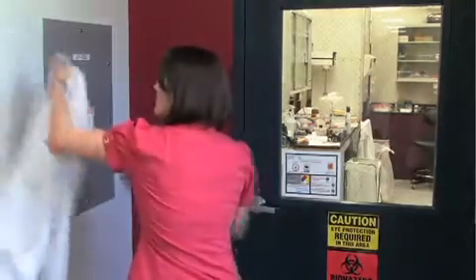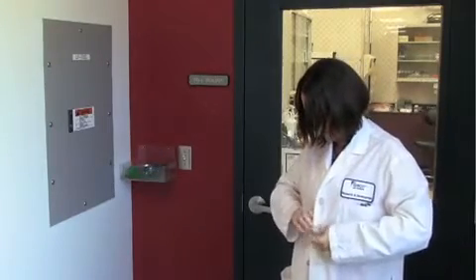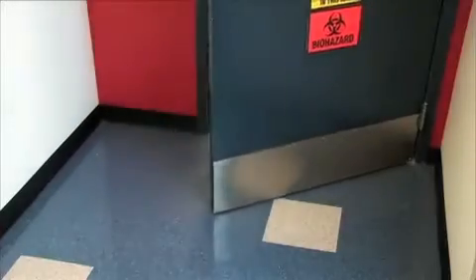Always wear basic personal protective equipment, or PPE, when working in the laboratory. Talk to the safety team at your institute for your required PPE. Also, remember to review the MSDS information before working with any media or reagents. Wear closed-toe shoes and clothes that cover your legs.